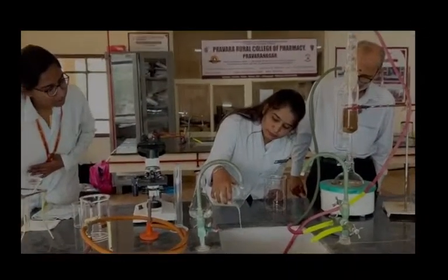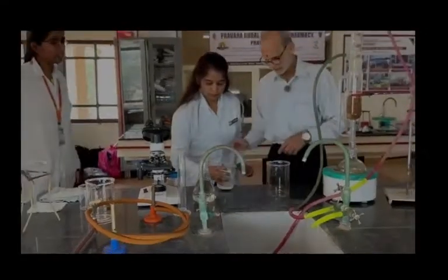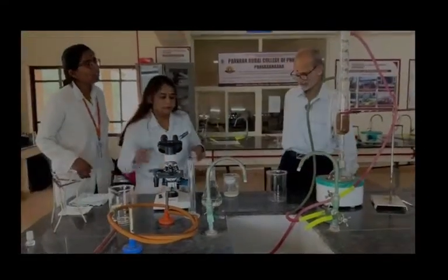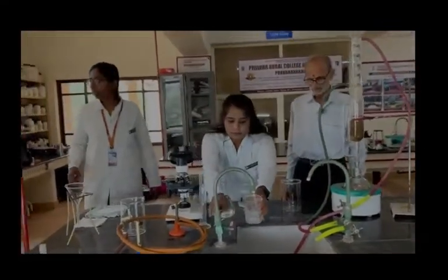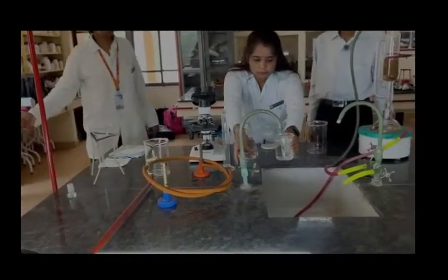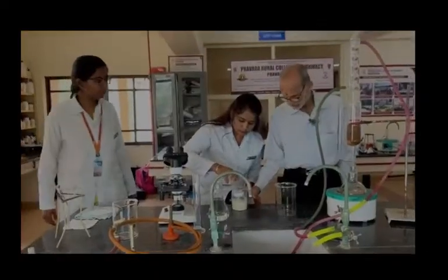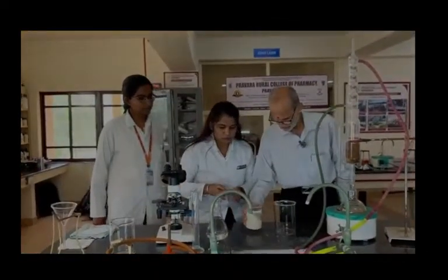Okay. Enough. So starch. Add more water. At the base you can see the layer of the potato starch which has been settled. So Ankita, what you do? Decant the supernatant. Give one more washing with water. Completely get rid of the water. Don't bother. Decant it. Quick. Fine? Okay. Enough.